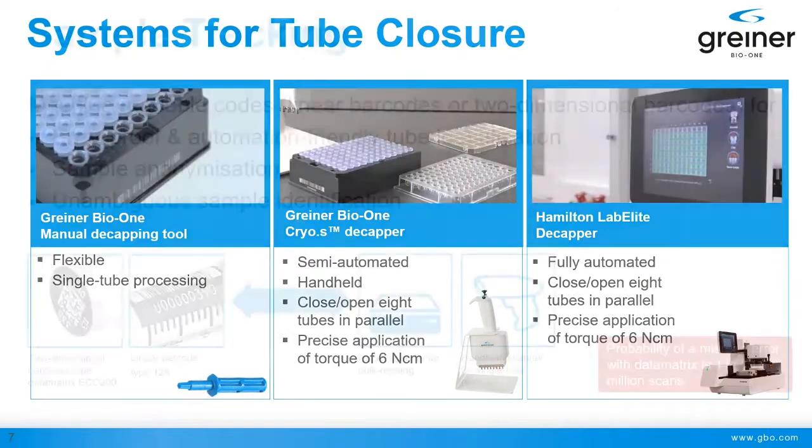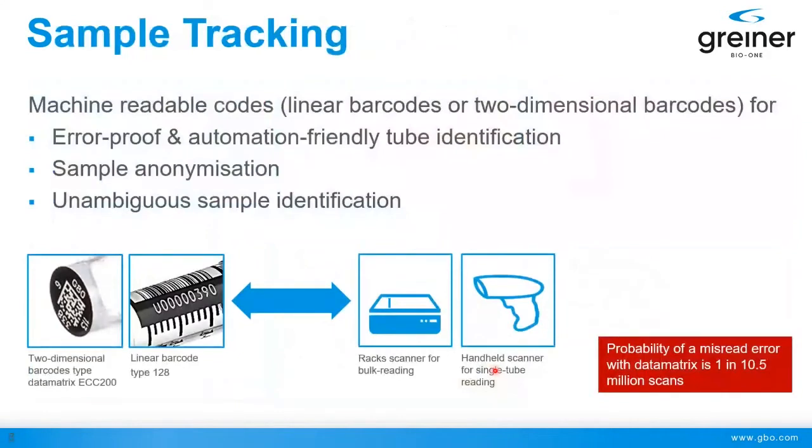Now I want to step away from aliquoting and closing the tubes, these very, very early steps in your workflow, but I want to move over to sample tracking, as I told you at the beginning.